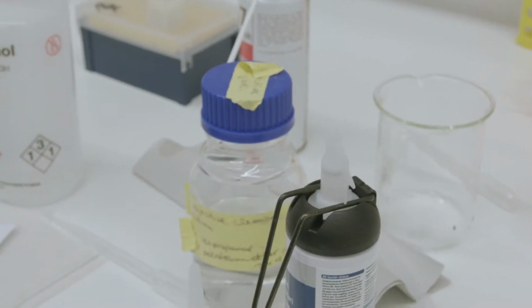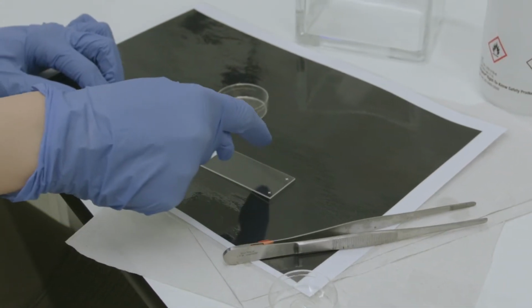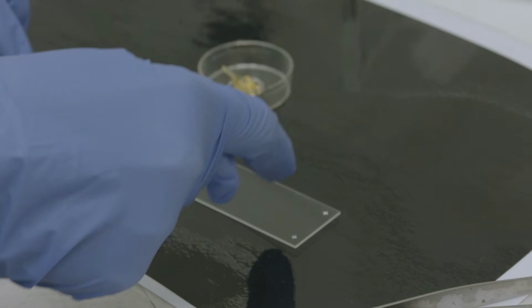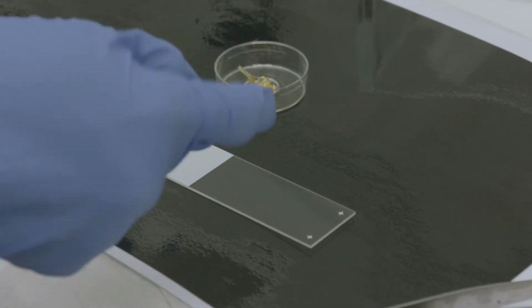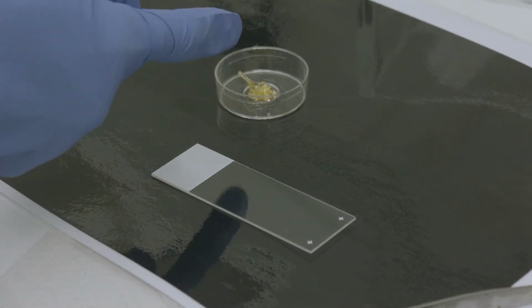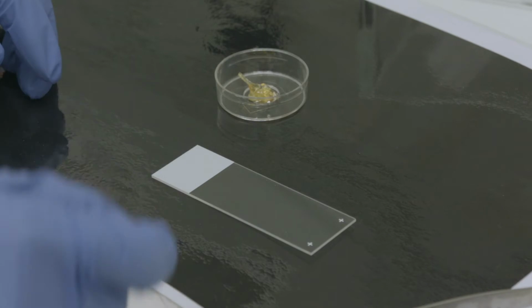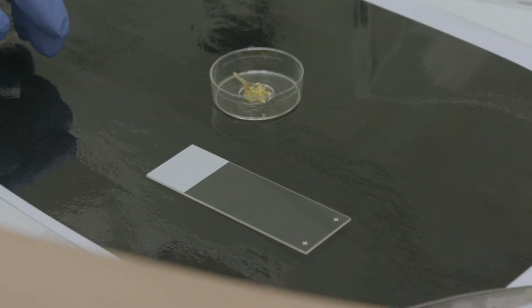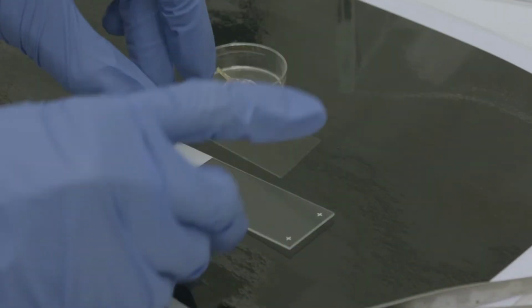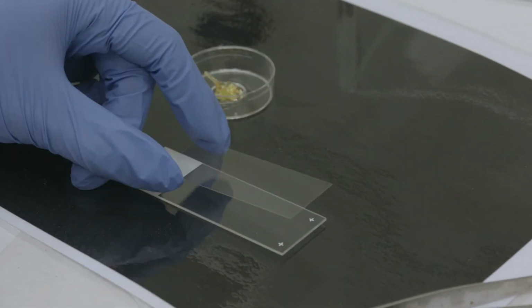From here, you can simply draw the pool with the wall as high as possible, depending on the size of your sample. If you have a very big brain, you can even put several layers of the silicone gel, like a cake. And then in the end, you just mount it as normal, trying to push out the bubbles.